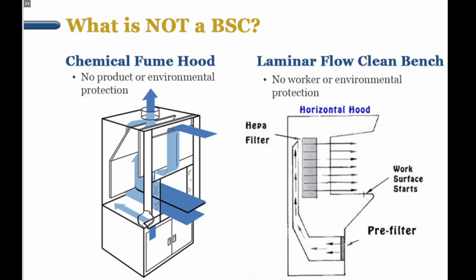The second is a laminar flow hood or a so-called clean bench. The air blows out of the enclosure and into the surrounding environment without being filtered. Thus, you're exposing yourself and the lab to whatever is being manipulated on the clean bench.